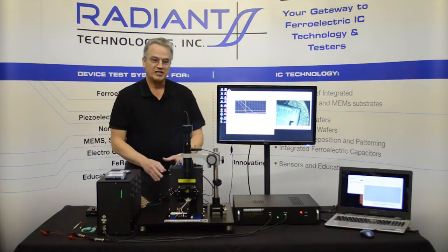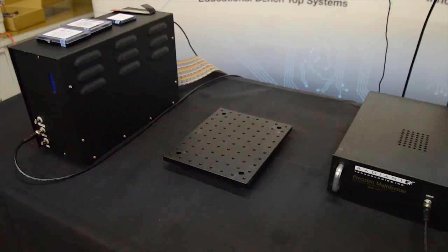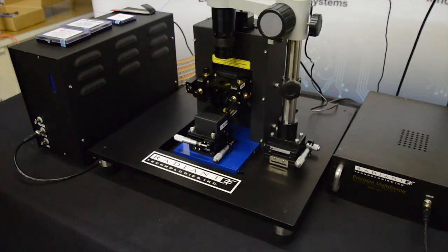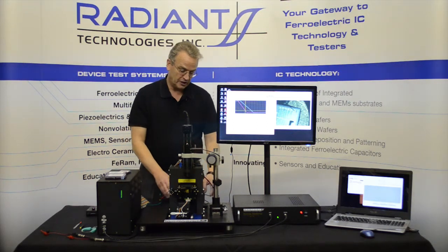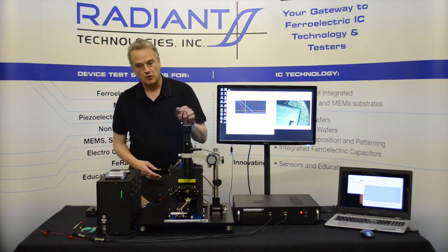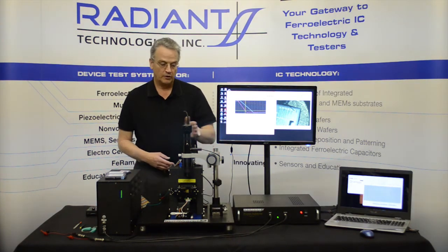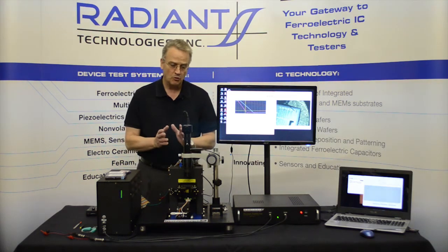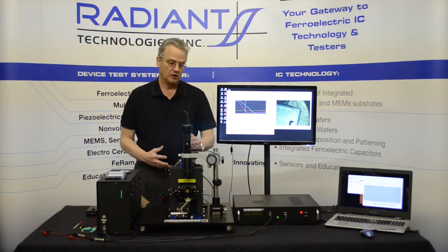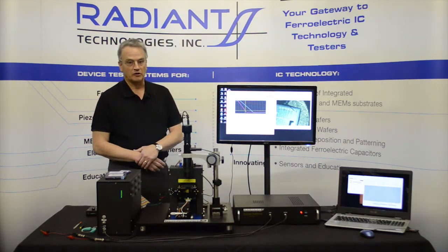The PNDS right now is mounted on a vibration dampening table. It comes in two pieces: a small damping table underneath on which the PNDS sits, and a larger platform that holds the camera. Both tables have cushioning legs which dampen vibration. The camera is a mechanical oscillator — a heavy weight on top of a steel bar acting as a mass and spring — so by separating it onto its own platform we reduce the ambient noise level of the PNDS while operating.